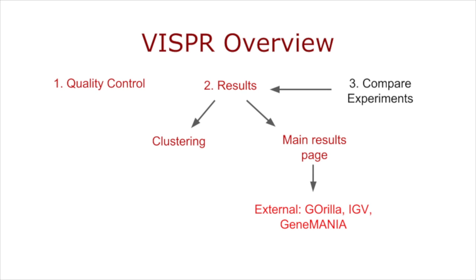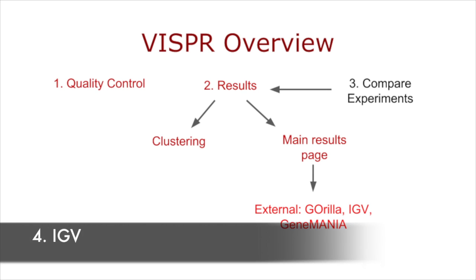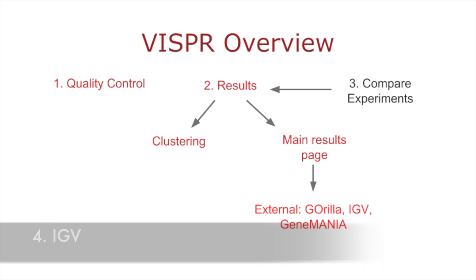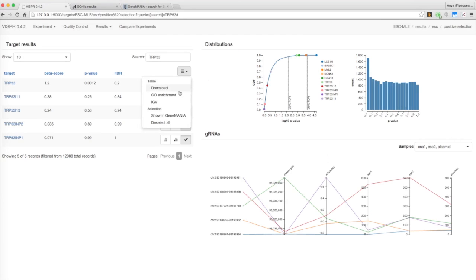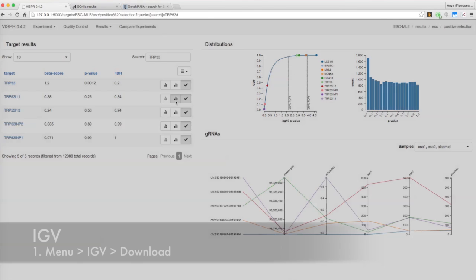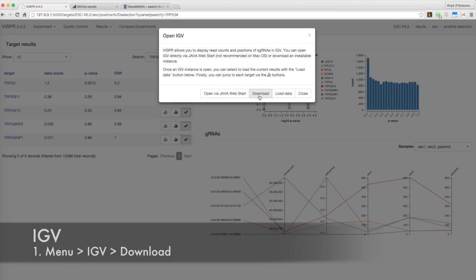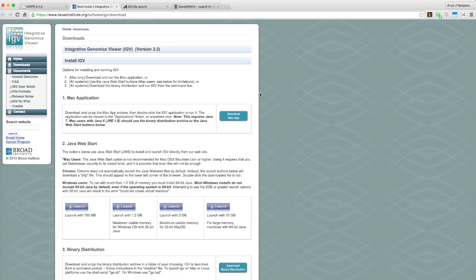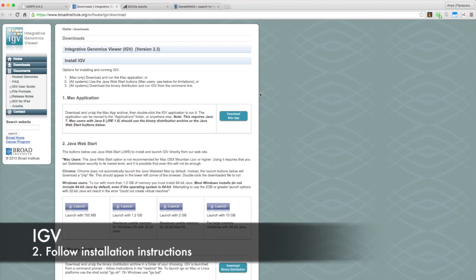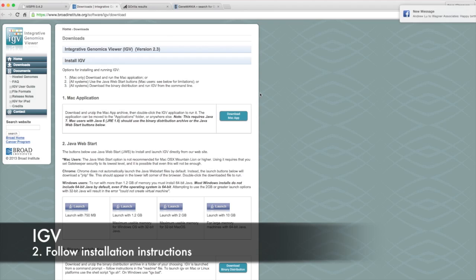Finally, Visper provides sgRNA read count and location information via IGV, the Integrative Genomics viewer. Go to the menu and select IGV. If you don't have IGV installed, click Download on the pop-up window to visit the installation page. You may have to complete a simple, free registration to access it. Then, follow the instructions for installation depending on your operating system.